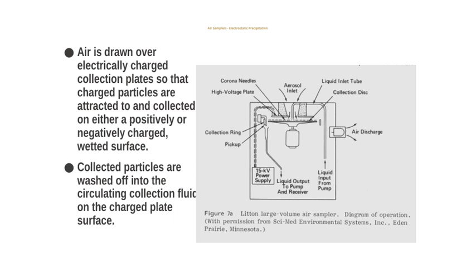What's important to remember is that electrostatic precipitation is a highly efficient way to collect airborne particles, especially when dealing with very small or elusive particles. This method ties into our overall theme of understanding air quality and how we can monitor it effectively. It's a clever use of electrical forces to improve sampling accuracy and efficiency.